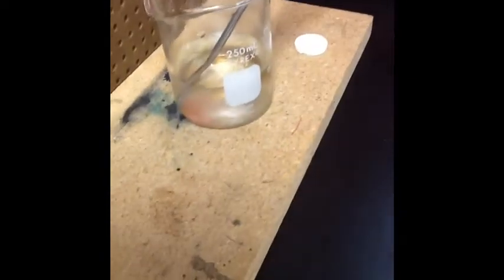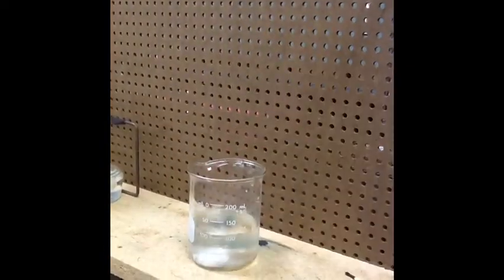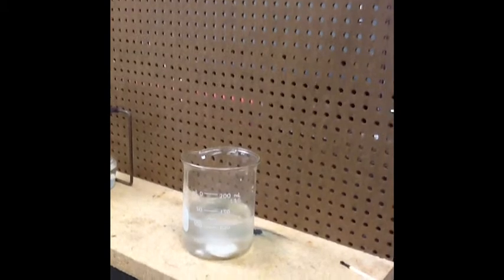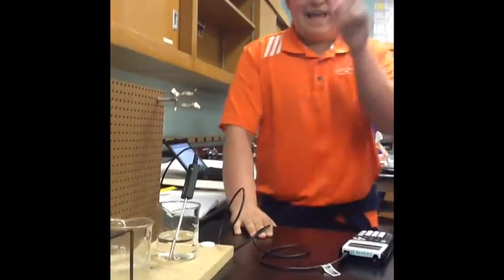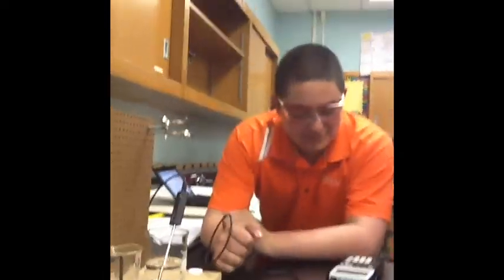6.7 degrees Celsius ice water with a tablet — you can clearly see the tablet at the bottom. This reaction seems to be a little slower than our heated ones. Hi y'all, this is Matt and Mr. Allen, and now we're going to see the temperature of this negative control.